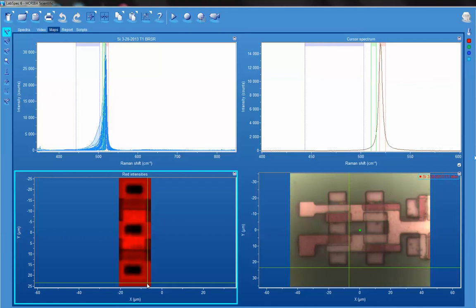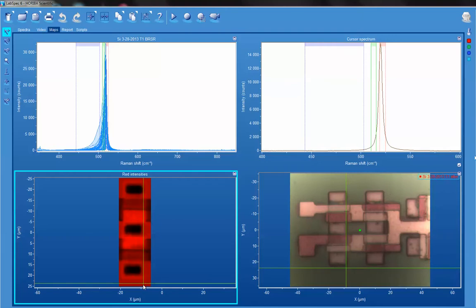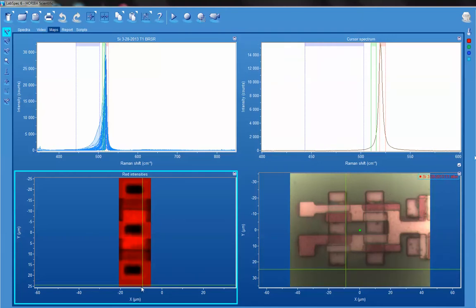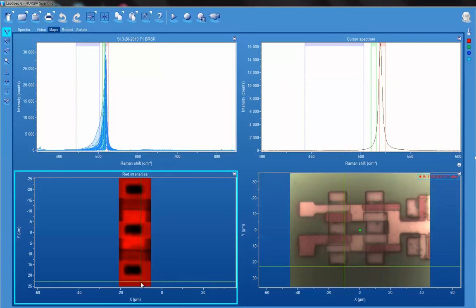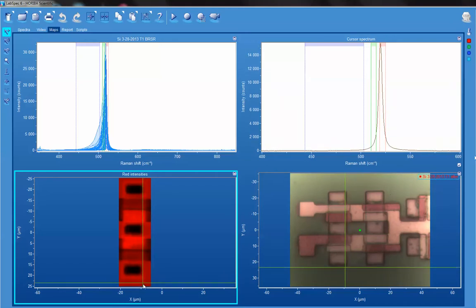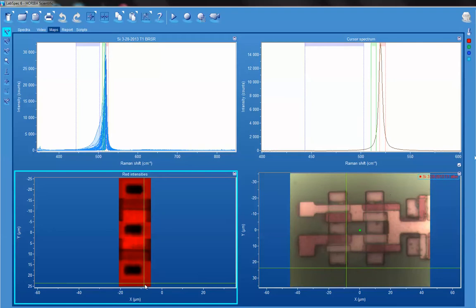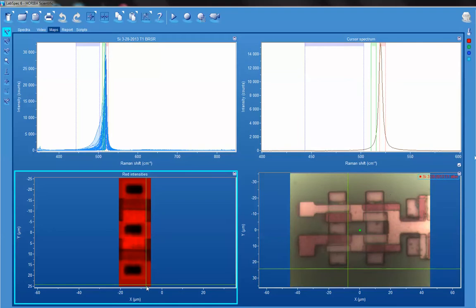As we move the cursor around, we see that the spectrum with the red bracket is essentially around the 520.7 reciprocal centimeter band of the substrate silicon.